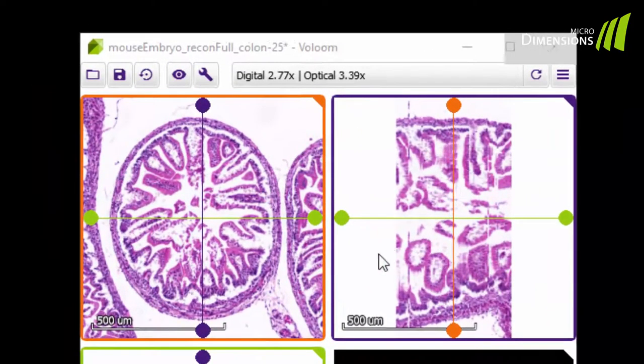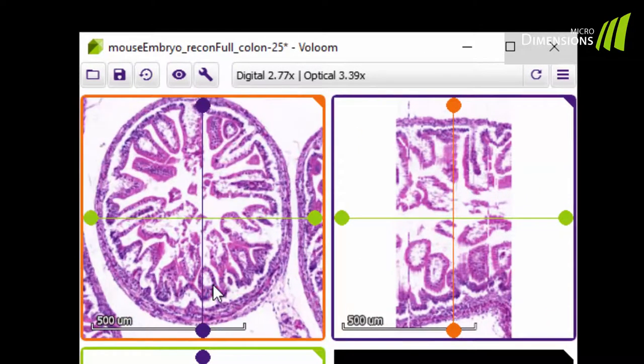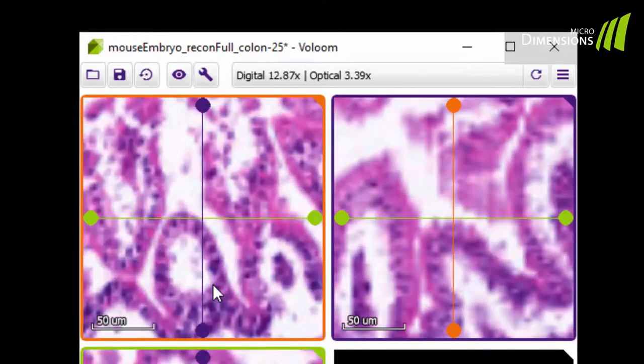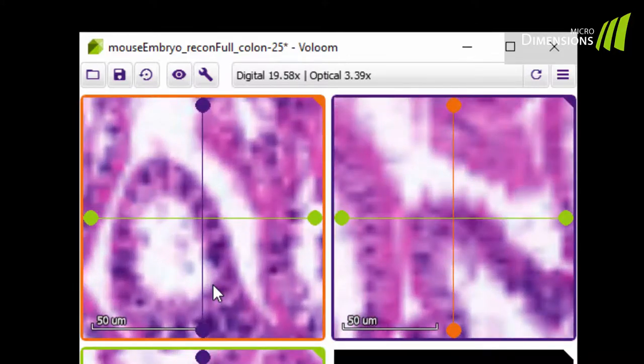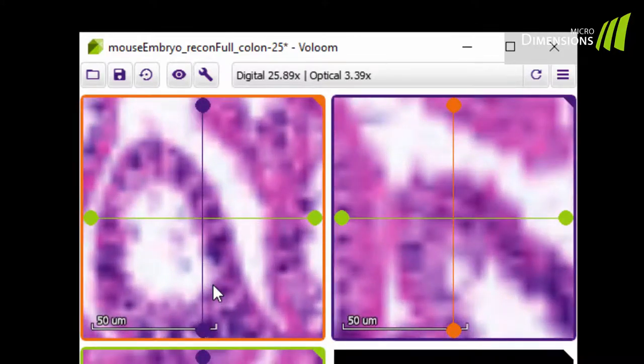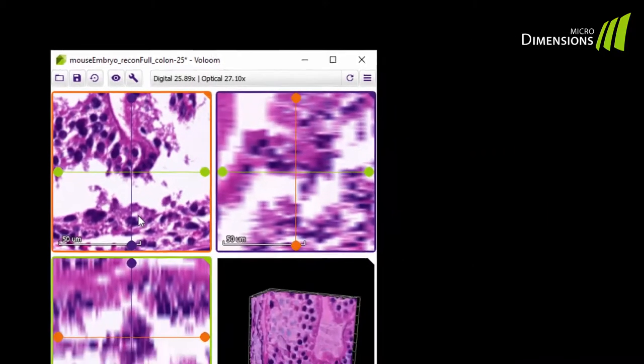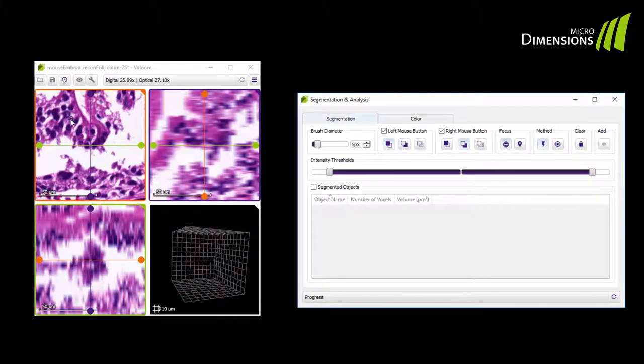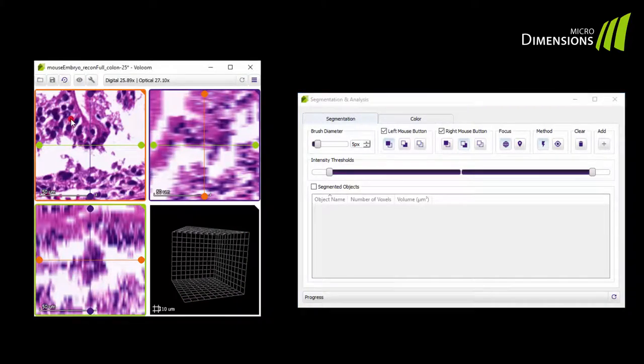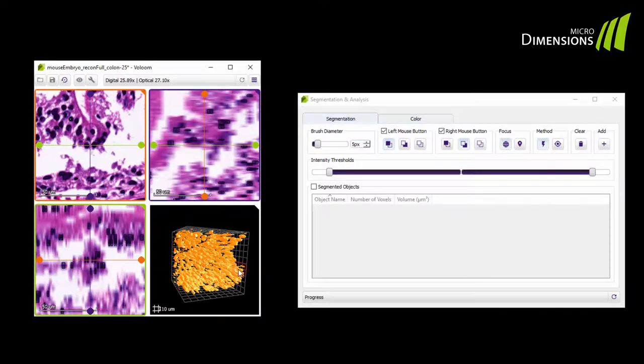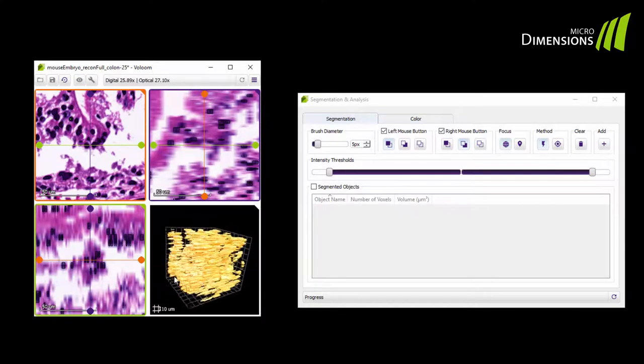I zoom into the dataset now and brush the dark nuclei. For the fast segmentation you just have to brush the objects, the foreground, but not the background. In the volume window you can already see the segmentation result.